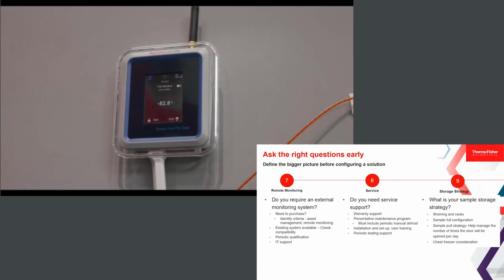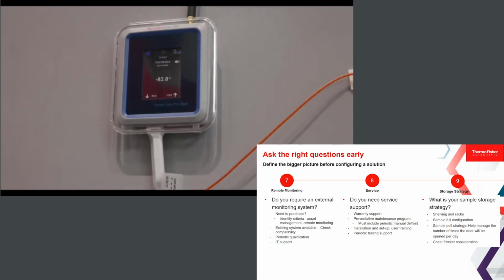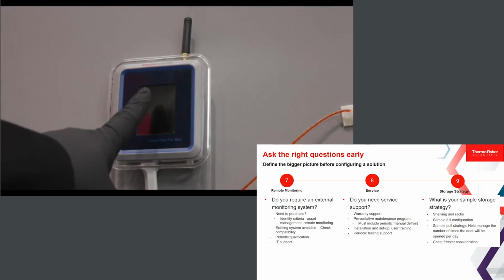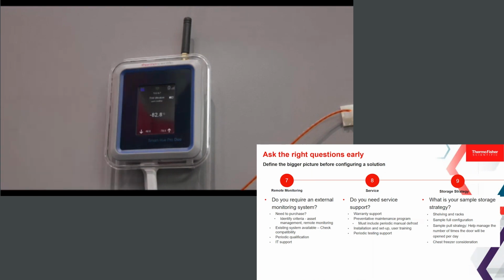So certainly think about remote monitoring, whether it's an external unit, whether we have built-in Wi-Fi on some of our products. There's lots of options out there between, just thinking about asset management or just simple remote monitoring. Certainly something to consider in every sale, every time you invest in cold storage. And I will just caveat that if you're thinking remote monitoring, think beyond just your cold storage. There are other critical items in your lab that could be part of the same system. So it could be helpful for the entire laboratory operation.